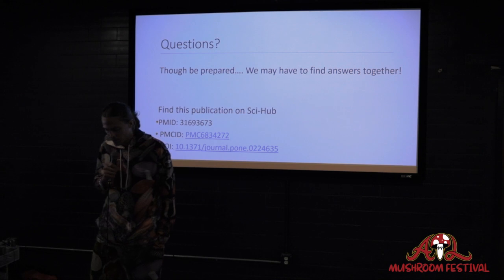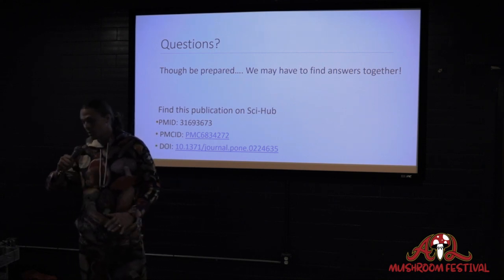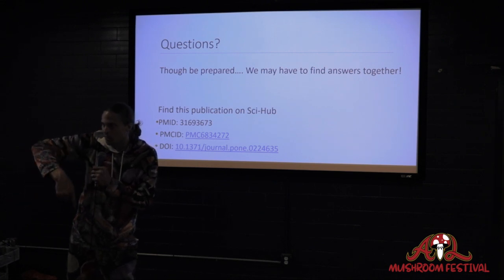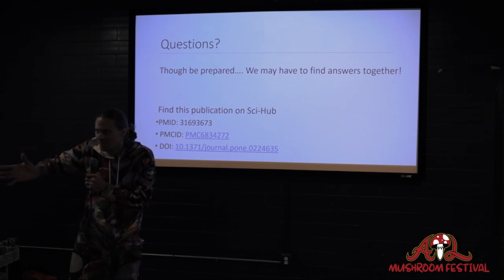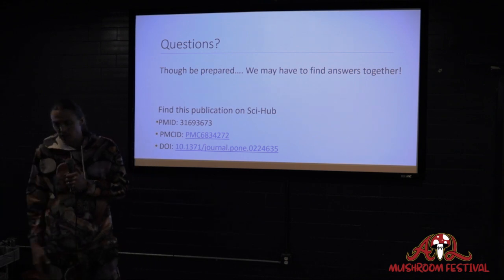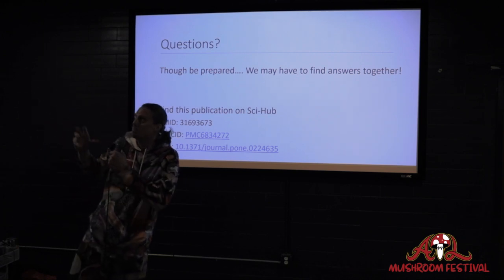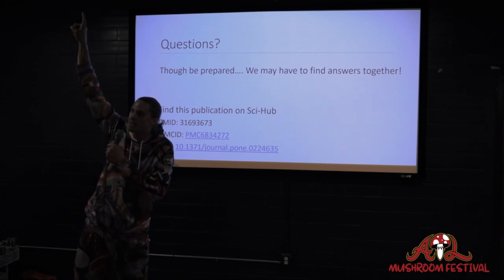The long answer is that if it's removed completely to some degree, it's not so far, because let's say you carve out a giant hole in the middle of the plate and you place a tiny little sample in the middle, nothing's going to happen. But if the roof is touching it, then you at least got some chance. But let's say it's so small it doesn't even touch the roof, right? Like the selection isn't big enough, and then it can puff up and try and reach for the stars, and maybe it might touch something it can keep growing through.